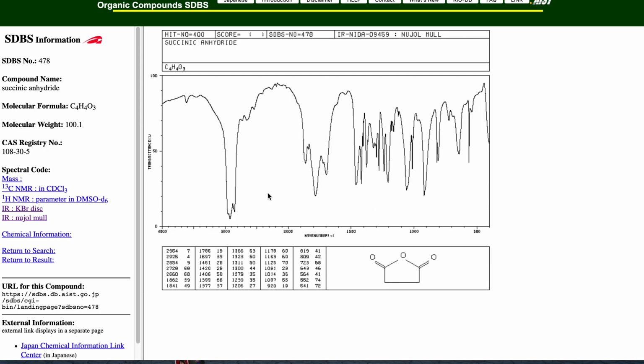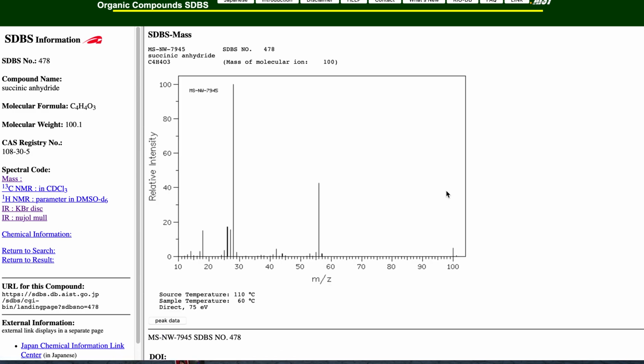Okay, now let me show you the mass spectrum. I'm clicking on the mass spectrum. And that is going to be appearing as a bar graph. The final week of Organic One Lab, week number 6, I'll be showing you the basics of mass spectrometry. And that's a very important research tool in environmental analyses, drug analyses.